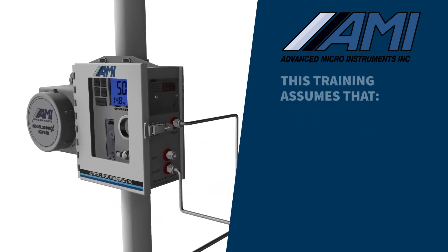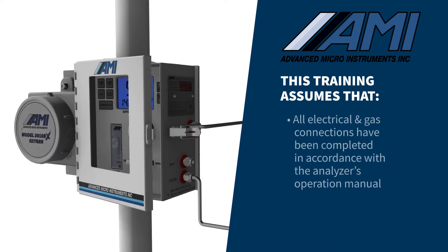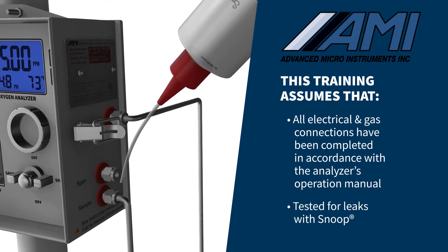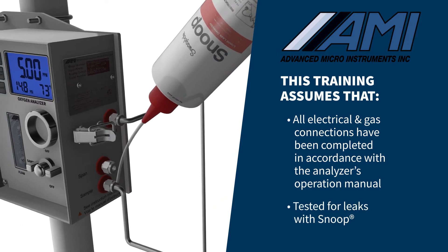This video assumes that all electrical and gas connections have been completed in accordance with the analyzer's operation manual, and all sample gas compression fittings have been thoroughly tested for leaks using SNOOP or equivalent.